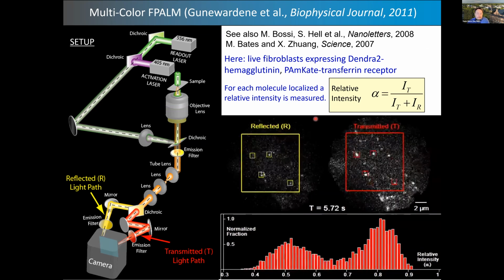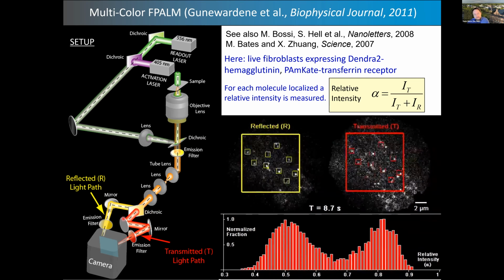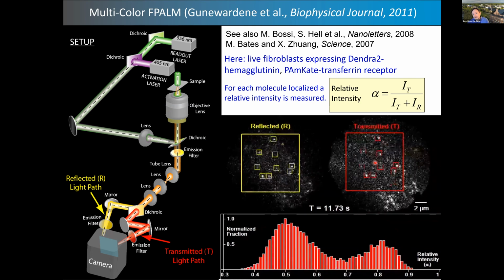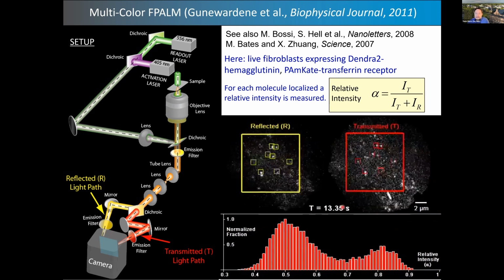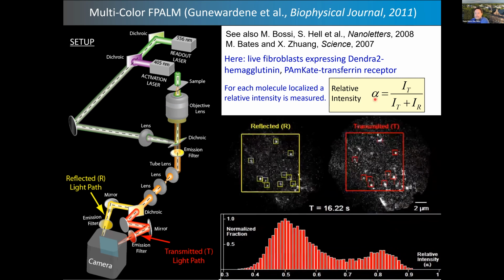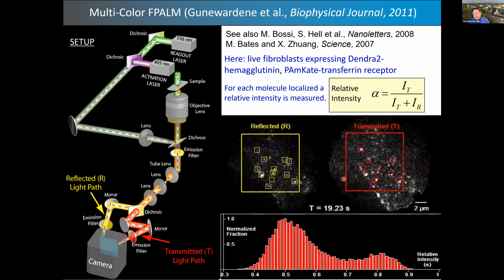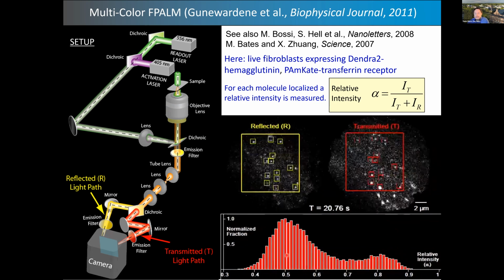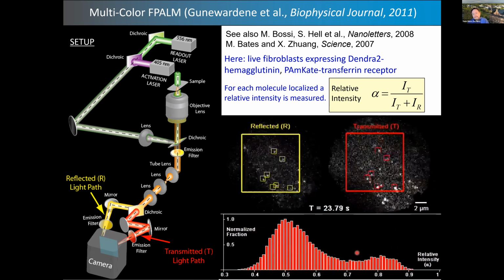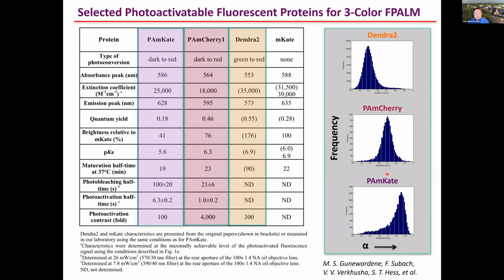One way of doing this is to take a dichroic in the detection path and split the light into separate channels, which are visualized on side-by-side regions of the camera. This is raw data with localization superimposed. And then we take an intensity ratio of the transmitted intensity over the reflected plus transmitted, which gives us a number between 0 and 1, which we call alpha. The alpha value for one type of fluorophore is typically different from another type, and we can then separate them spectrally and get even 3 or 4 things at once for 3 different fluorescent proteins.